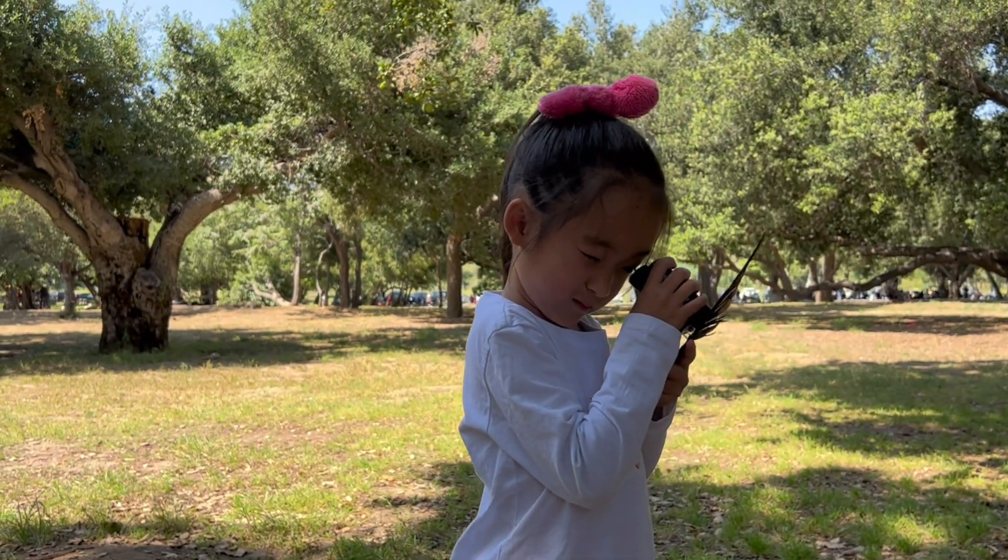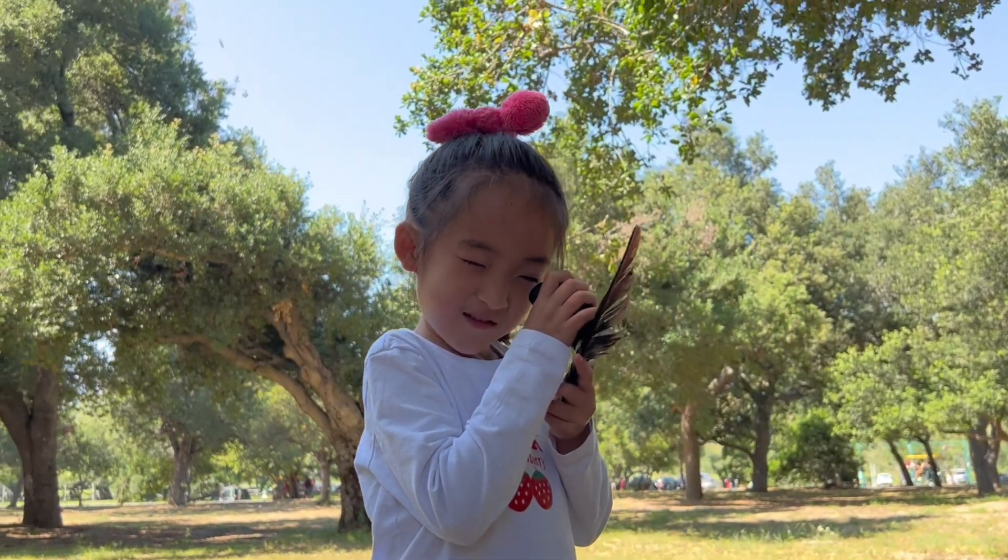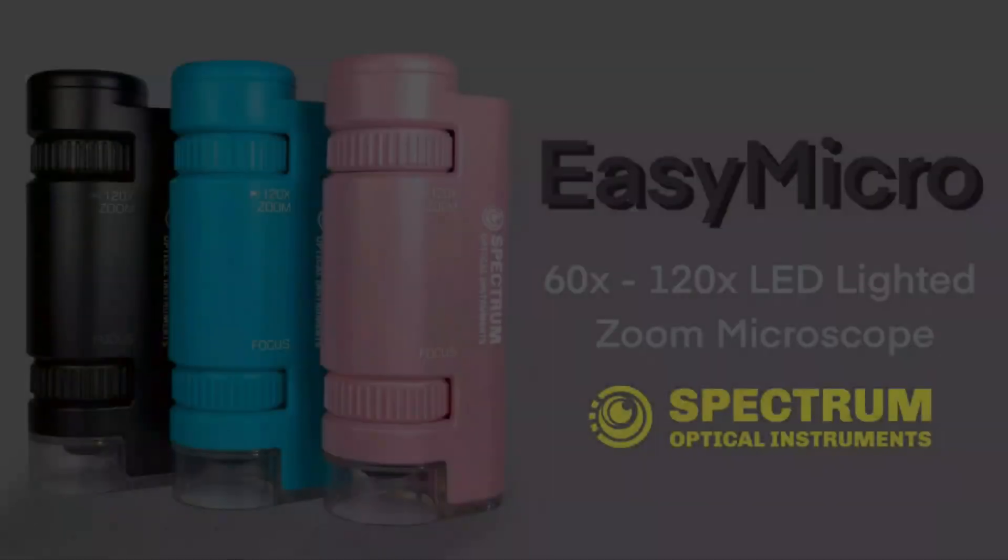The EZMicro is the perfect starter microscope for you to delve into the fascinating, tiny world around you. Keep exploring!